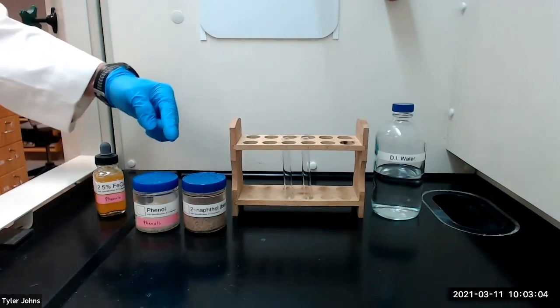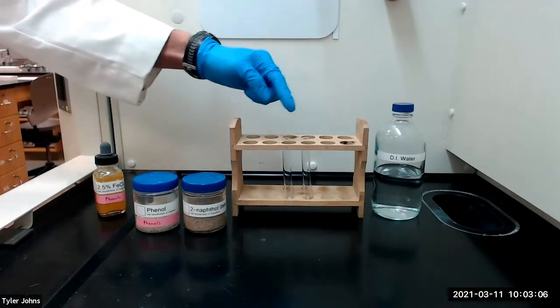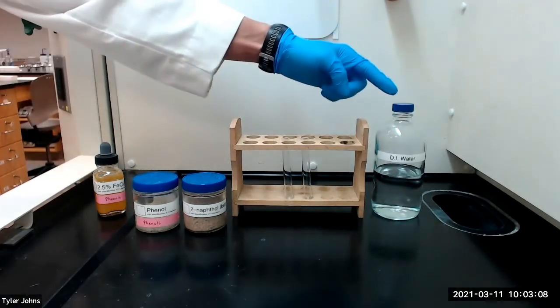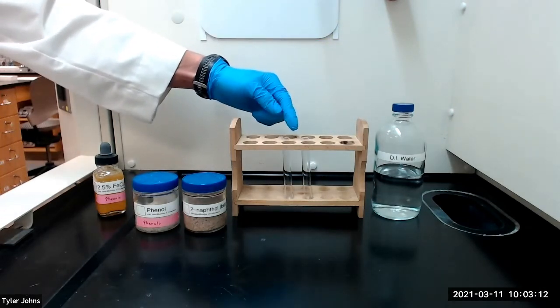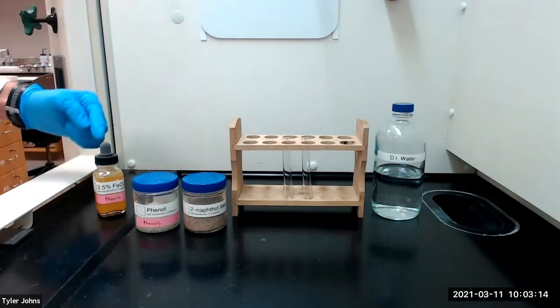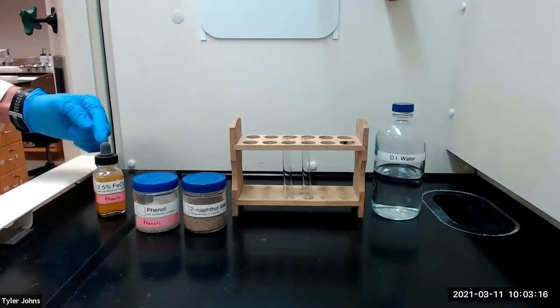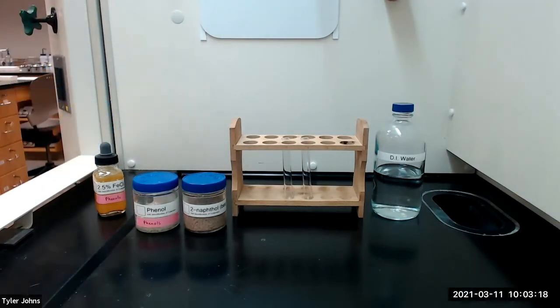We will begin by adding a small amount of the test compounds to separate test tubes. We'll then add one milliliter of deionized water to each test tube and mix with a micro spatula. We'll then add several drops of 2.5% aqueous ferric chloride solution.